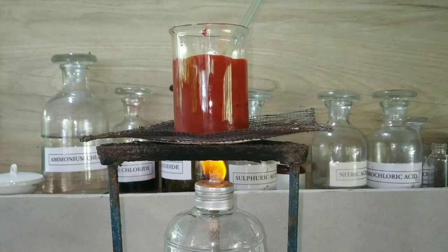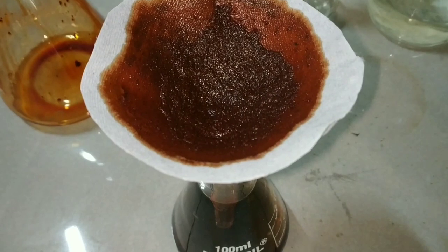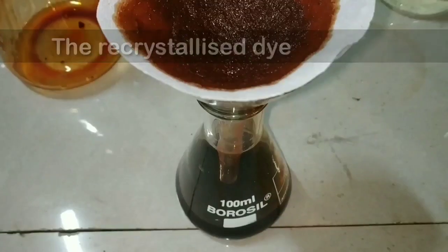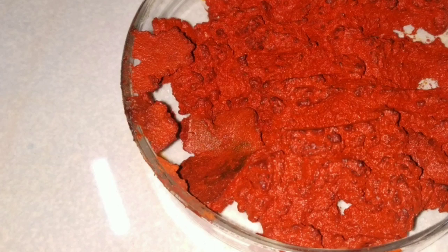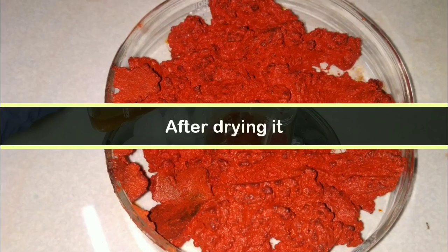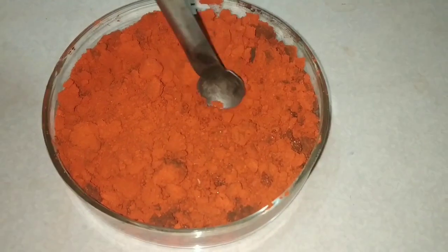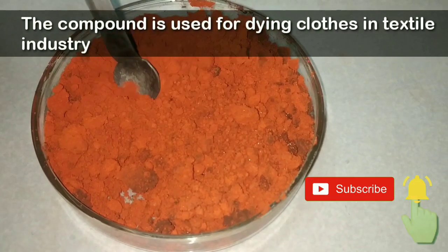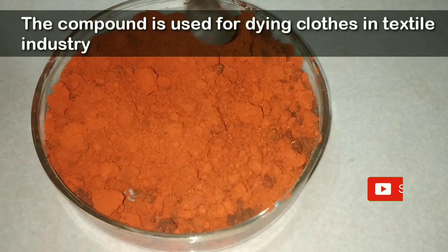After warming the solution, I filtered it out and the filtrate was cooled, obtaining crystals on cooling. The rest of the dye was washed with acetic acid. After drying, you can see the 2-naphthol aniline dye. This compound is used for dyeing cloths in the textile industry.